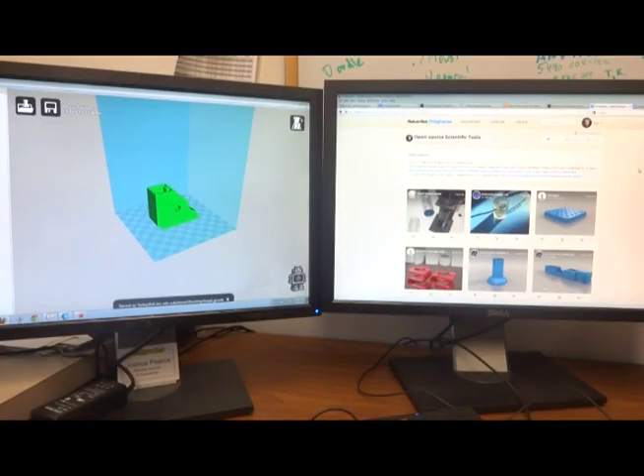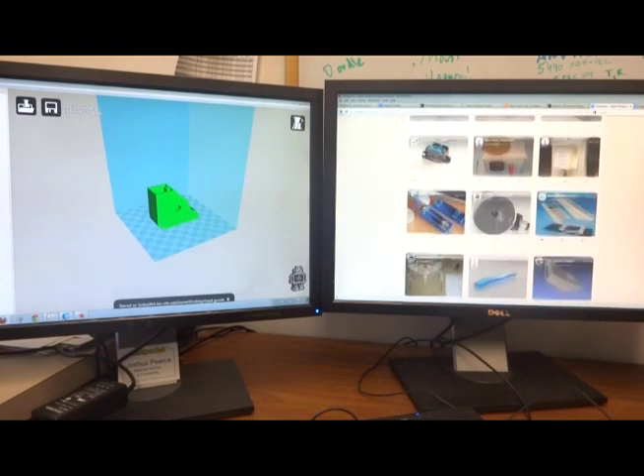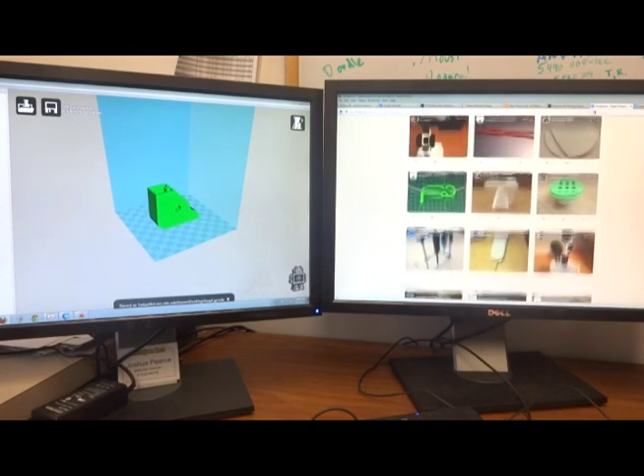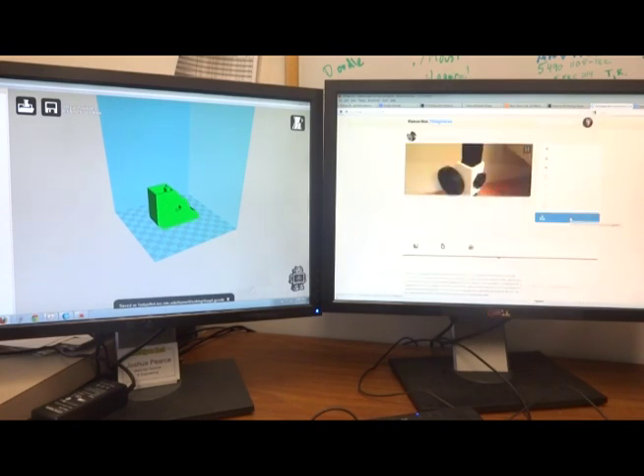Let's quickly go through the software toolchain for using open source scientific hardware. You would go to a site like Thingiverse, where I currently maintain an open source scientific tool collection. There are hundreds of scientific tools that have already been designed, and you can simply search by keyword or browse through things you might be interested in. For example, if you're interested in printing a completely printable optical microscope, you can find one of these pieces and easily download it.